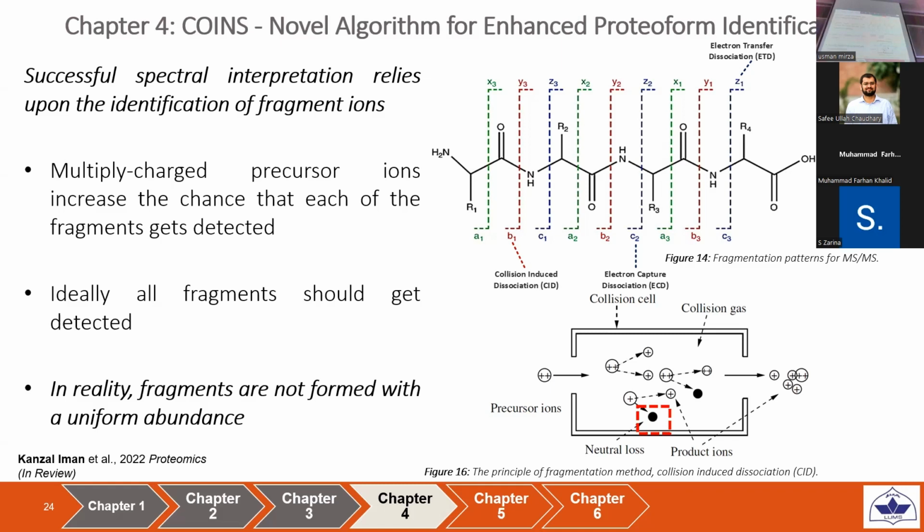But there's also the same kind of fragmentation in bottom-up. This is the basis of MS2. That fragmentation is of peptides. Doesn't matter, the fragmentation phenomenon is the same. The principle is the same. The input is different. In this case, the input is an intact protein. In that case, the input is not.